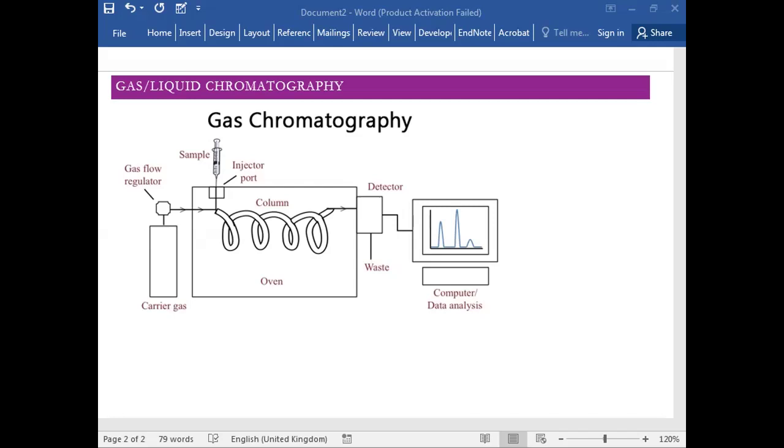If they try to stick to that wax and you do not want them to get stuck to that wax, so what can you do? You can either make the gas flow very fast, you can heat up the oven more, like a wax to melt हो जाए, but whatever component is trying to get stuck to the wax, फोड़ कर निकल जाए. Is that right? So sooner or later, by making certain settings, you make sure कि सब कुछ end पे आ जाए. Now the things that are trying to get stuck to the wax, वो देर से आएगी, but आ जाएगी. Is that right or wrong?